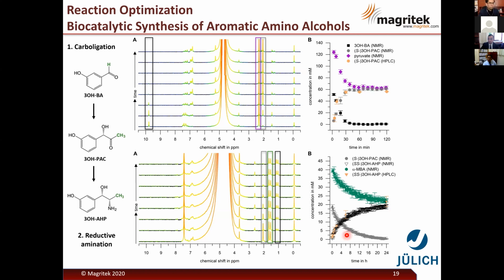So overall, in this example, benchtop NMR enabled the researchers to detect concentrations of different components in a buffer solution down to the single-digit millimolar range without a solvent suppression technique. The concentrations obtained from the benchtop NMR were in good agreement with the offline HPLC measurement.